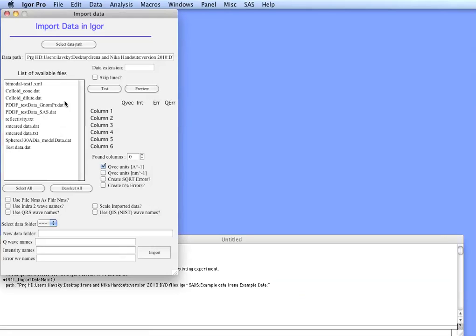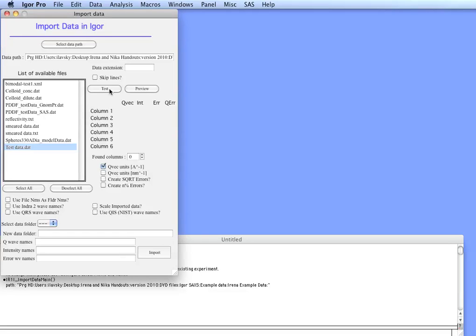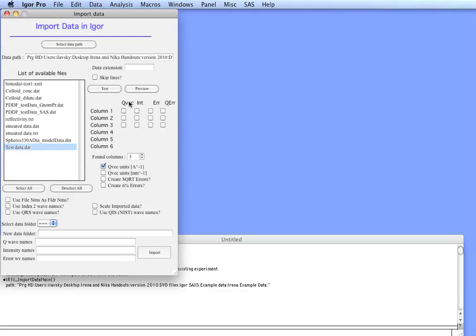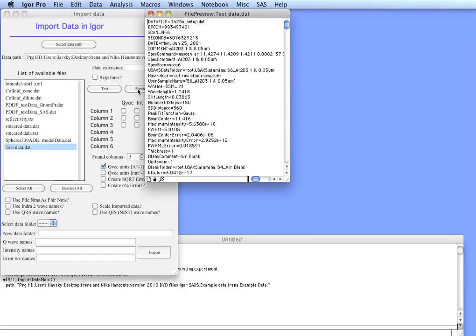Here's a list of all the data files which are included as examples for various tools of IRENA. Let's click on the test data and if you now hit test, Igor will test how many columns of data there are. It found three columns and you can preview the file.